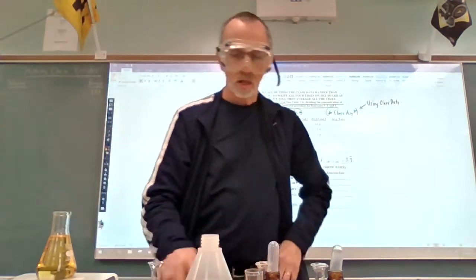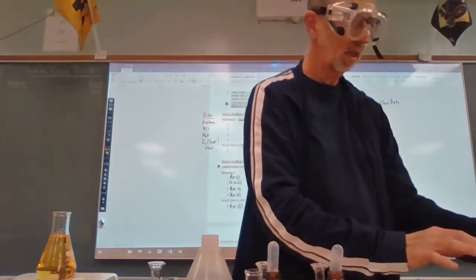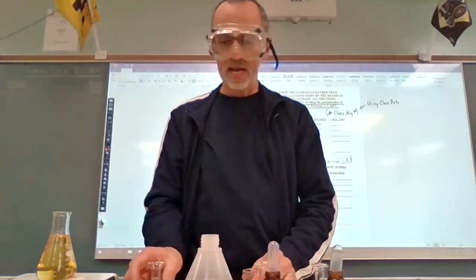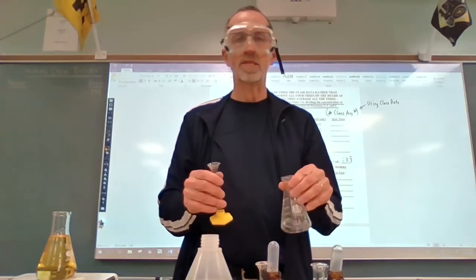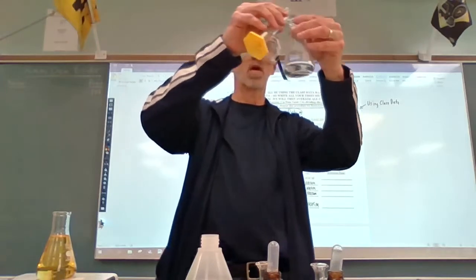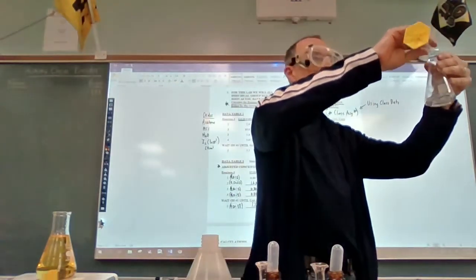I'm going to get this old stopwatch ready here. All right, so when I add the iodine, the clock will begin, and we'll see how long it takes for the reaction to go to completion. It would be nice to have a third hand here, but that's okay.